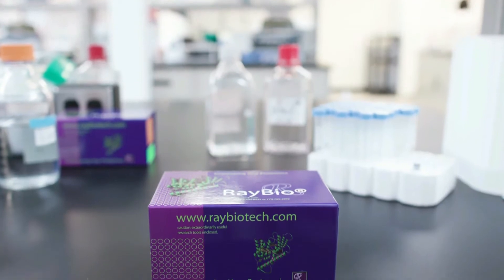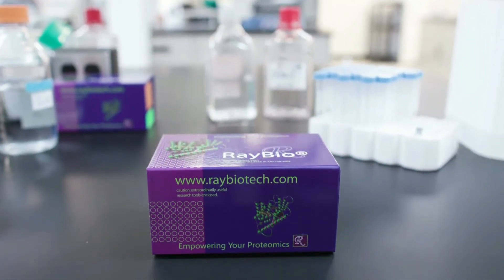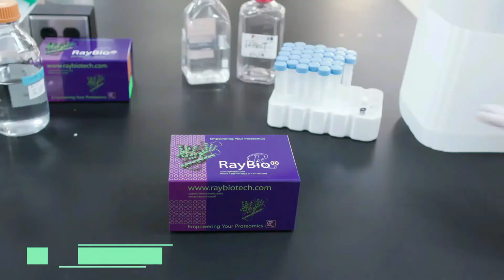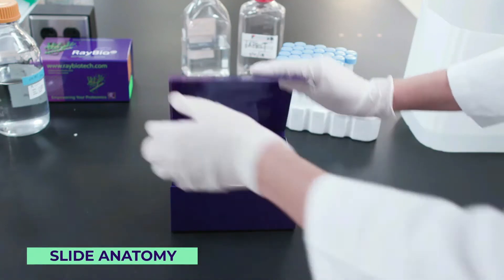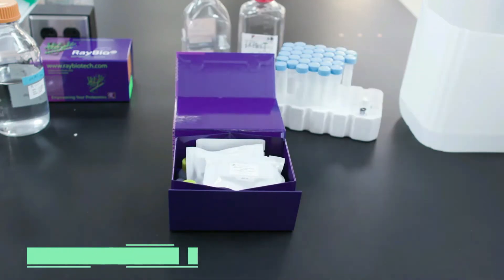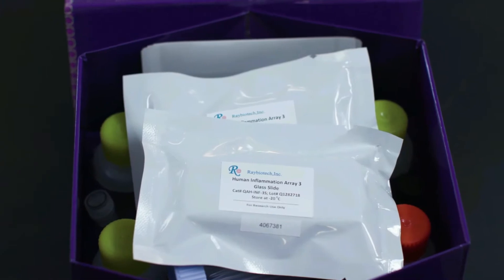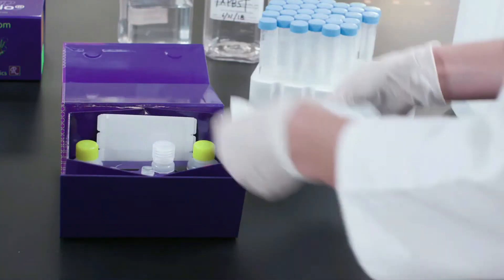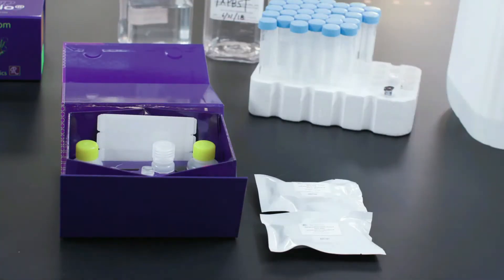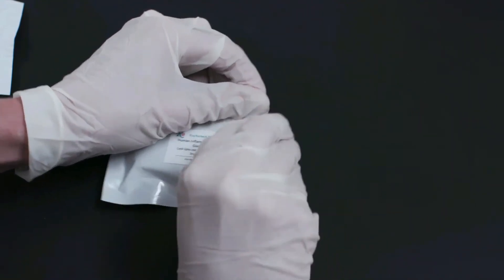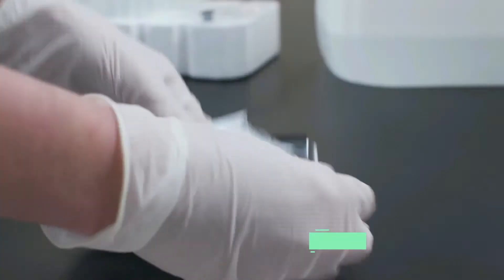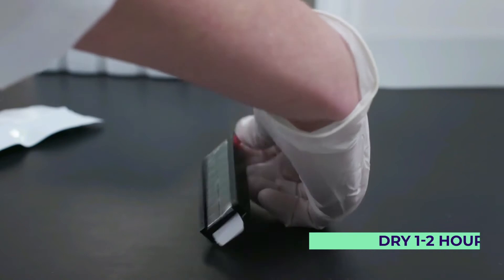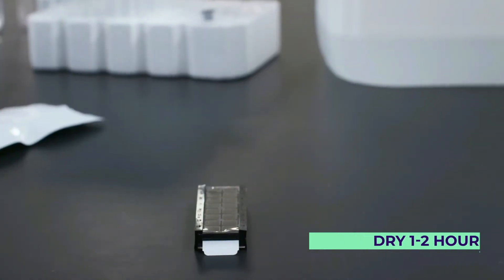Hi researchers. This video is an overview of best practices for handling RayBio glass slide antibody and protein arrays. After removing your array kit from the freezer, let the slide equilibrate to room temperature for 20 to 30 minutes before opening the bag. After unwrapping, the slide should be completely air dried before use, which usually takes one to two hours. This step is very important as residual moisture can result in smearing of the antibody spots.